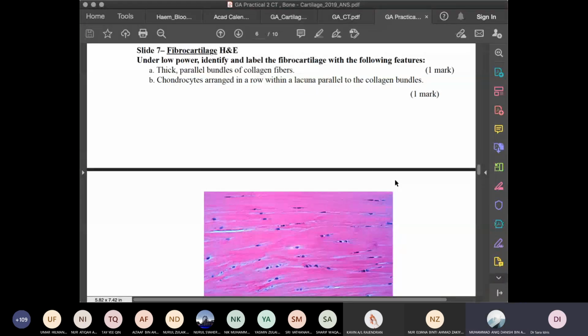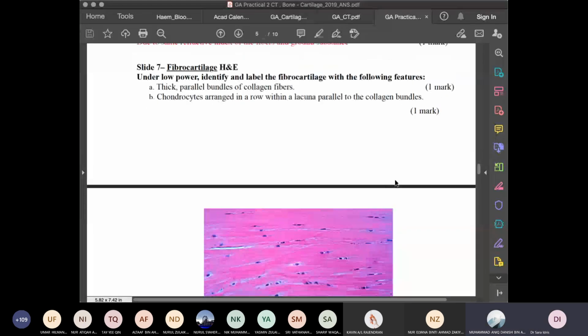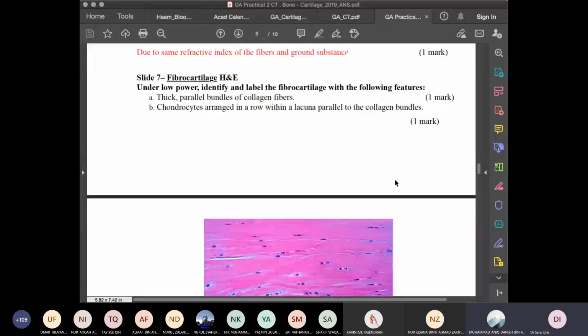Sorry, your chondroblast. So when they are growing, obviously they're going to have their progenitor cells to go there. But this is what we're talking about in mature cartilages. Hyaline cartilage and elastic cartilage have these reserve cells, this early chondroblast, so they can repair themselves, but fibrocartilage cannot because of this particular reason.